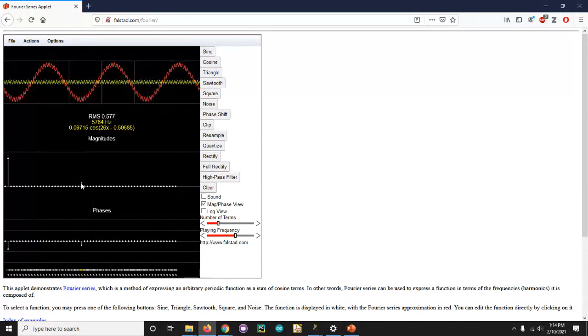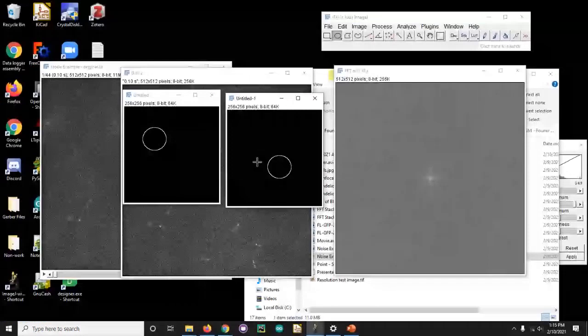So the effect of the phase shift on finer frequencies is much smaller, because for a given 2 pi phase shift, they can only phase shift the width of their wavelength. And so as a result, if you look at a phase map, they are not intuitive. Humans are very bad at extracting information from phase maps. But one useful thing for phase maps is, this is the classic problem of image registration. So how do we register this image and this image? And a lot of times it actually is done using the phase maps. It basically looks for the correlation of the phase maps.